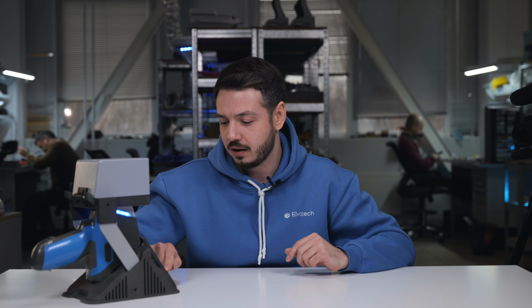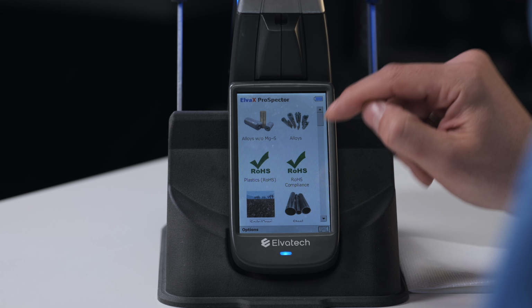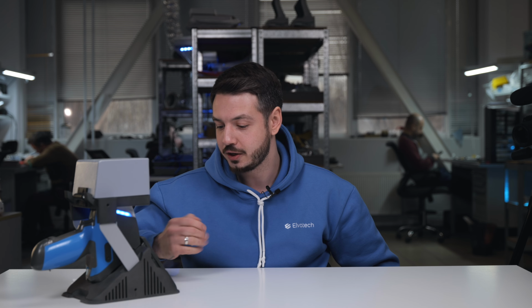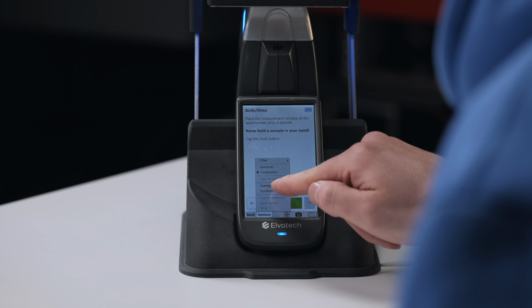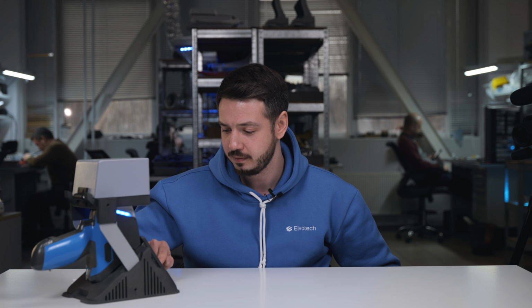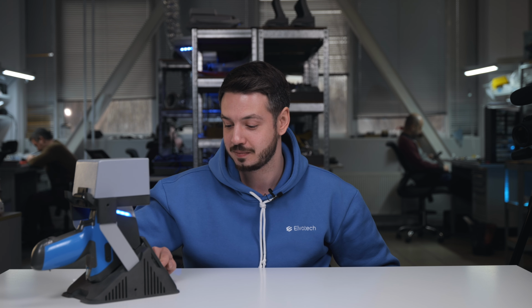We position it on our lab stand because we really need the lab stand for this. It's always better to work with them when you work with soils or powder samples and liquid samples, when you're using cuvettes, in different words. And let's go back here to our device because we need to choose our calibration and the duration. Our calibration is called the soil ores, and the duration of analysis we can set up for 5 seconds as usual because it's absolutely enough for a fast check-in. Right, seems we are done, everything is ready, and we can start our analysis.